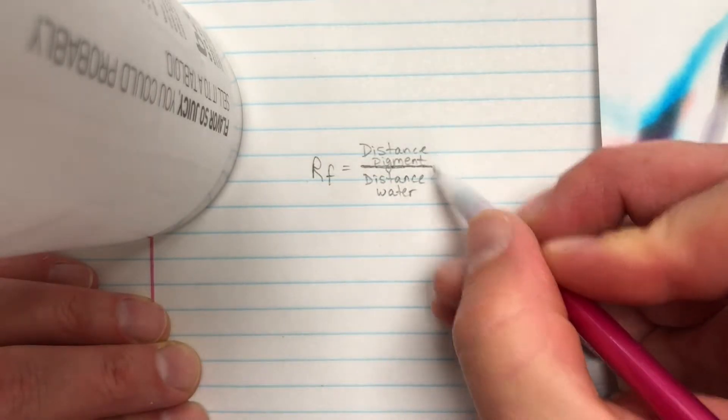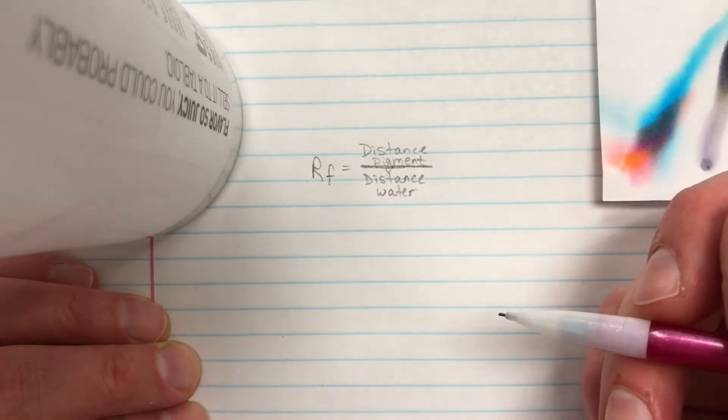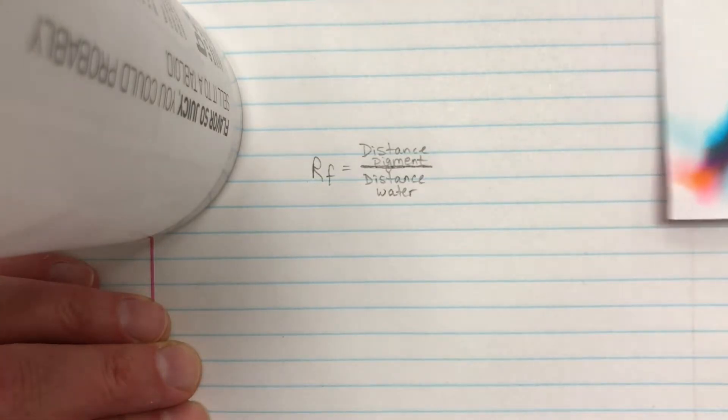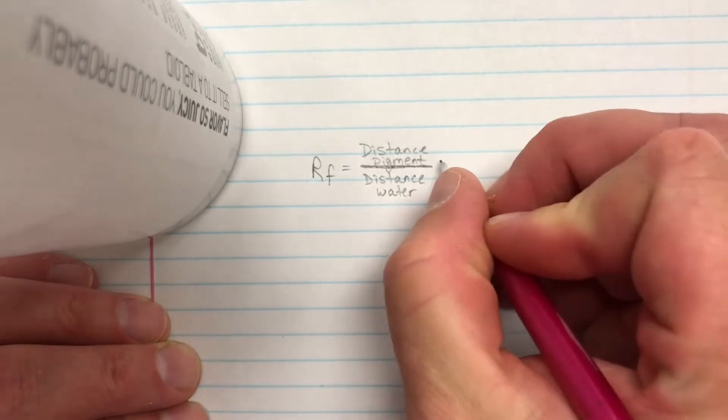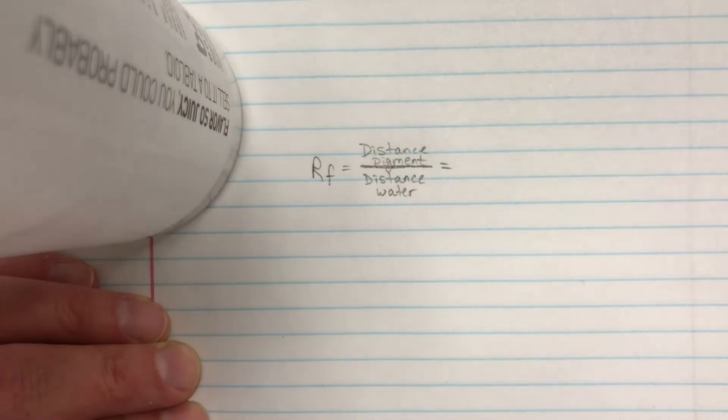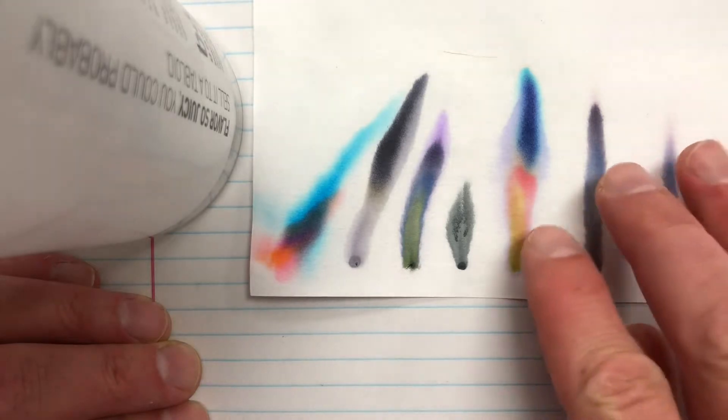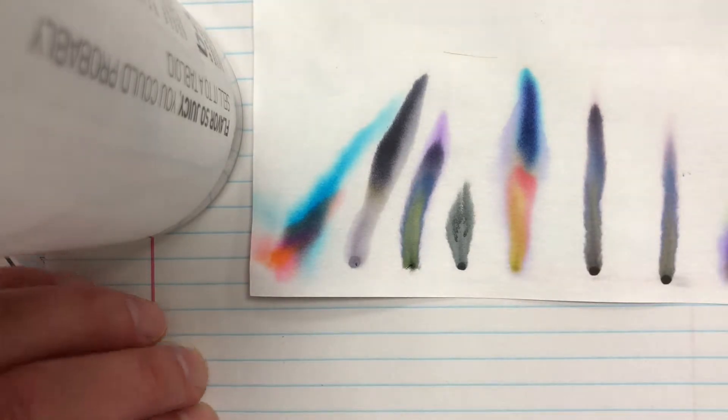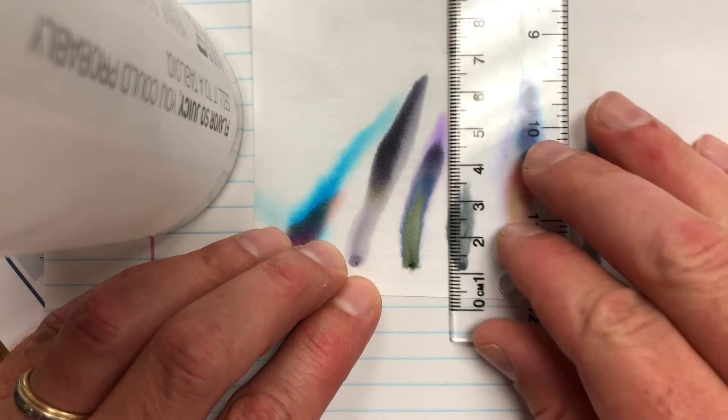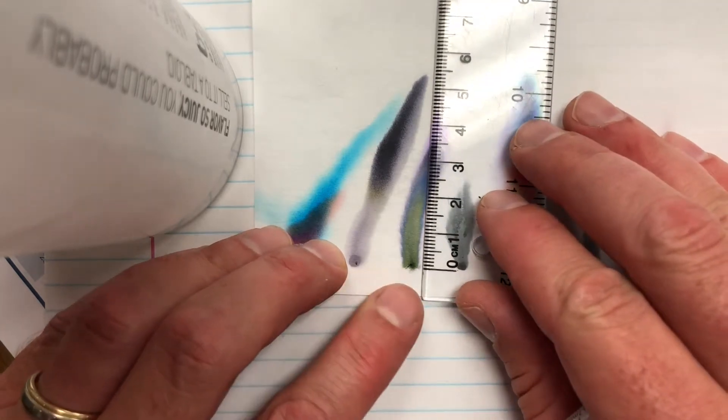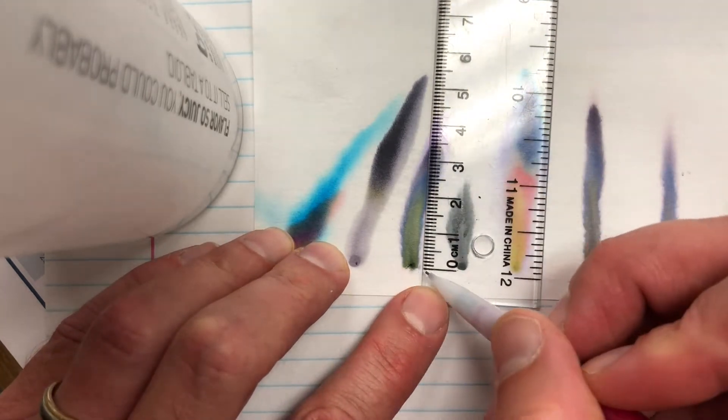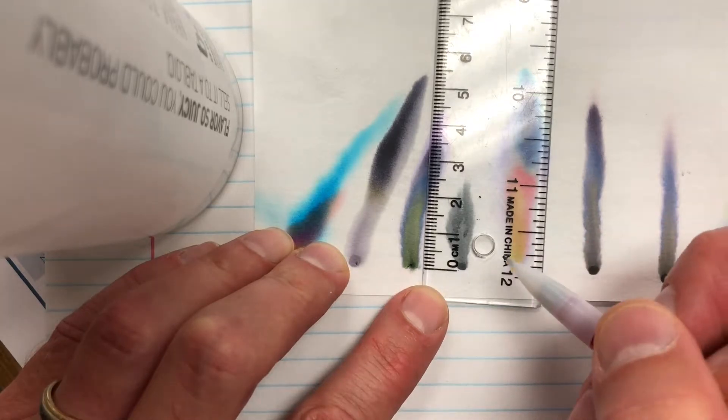You can use millimeters or centimeters for either of these. So for instance, what I want to do right now is find out, let's take a look at this sample, let's use sample three. I'm going to find out what the total distance of the water was. So if I take my ruler here and I'm going to use centimeters and I go from the very bottom right where the dot was.